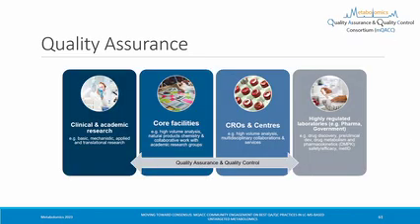So looking across the different types of labs, these are the ones I could think of. I'm sure I missed something, right? But we have our clinical and academic research groups, PI-led groups. Could be small, could be large, right? Usually in academic institutions. We have core facilities, often similarly in academic institutions, but they're running at a different scale, and they're a little more service-oriented, right? Collaborators come in, and there's a little more accountability there. It's not their own personal research, so if you screw something up, you've got to go back to the logbooks and be able to absolutely demonstrate that you followed procedures correctly. Then you have the argument about was it your samples or my analysis, right? And that's where liability comes into play.